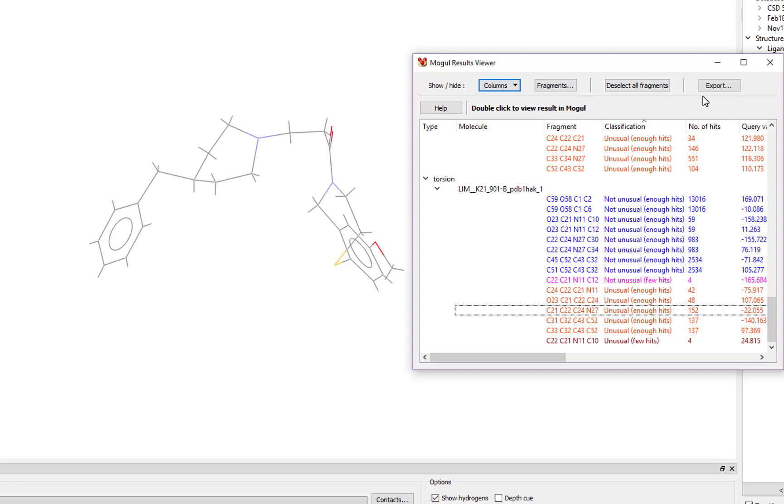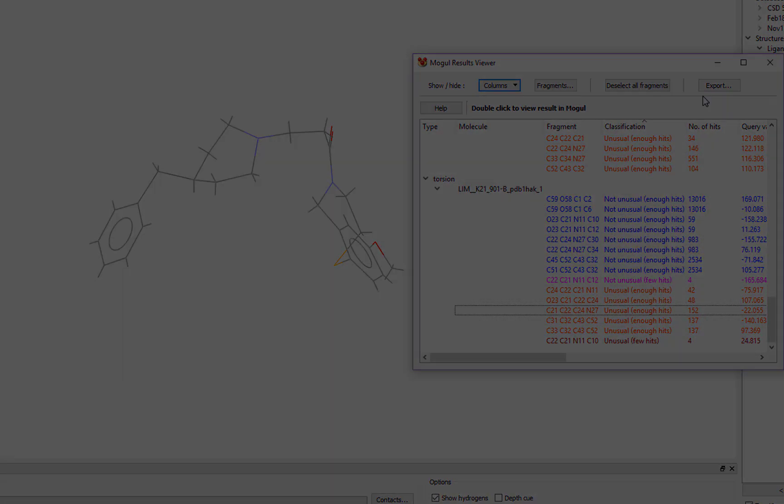Hopefully this example has given you some information on how to run a Mogul geometry analysis and interpret the results. For more information, see our website and workshop materials.